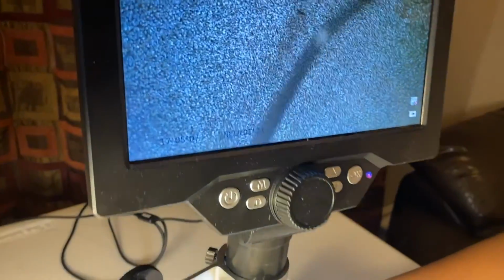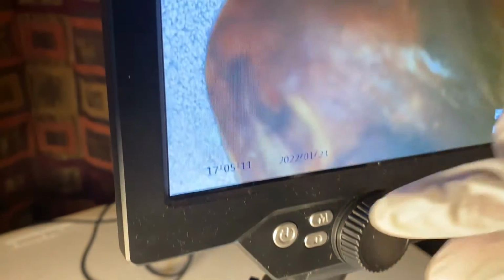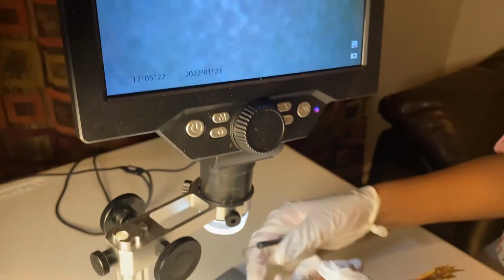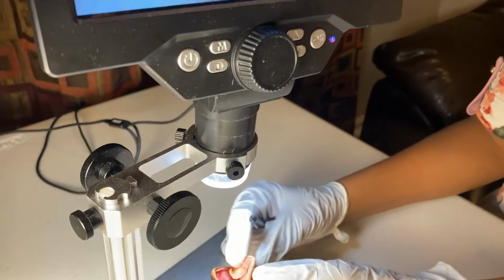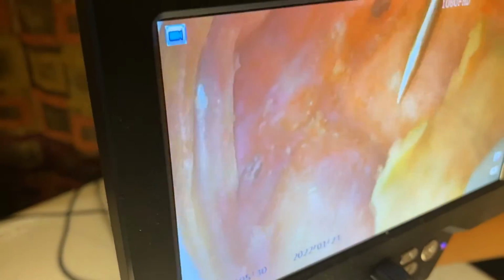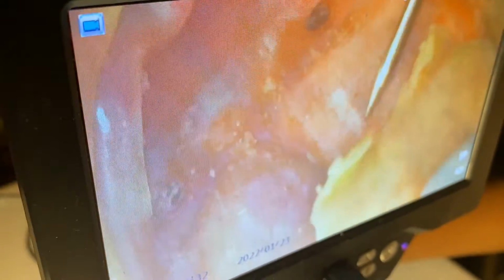So those were the internal nares, and these are the external nares. They're like the nostrils of the frog. Right here. Back to the mouth. When you look at the mouth, you're going to see these two bulges. One here and one here.